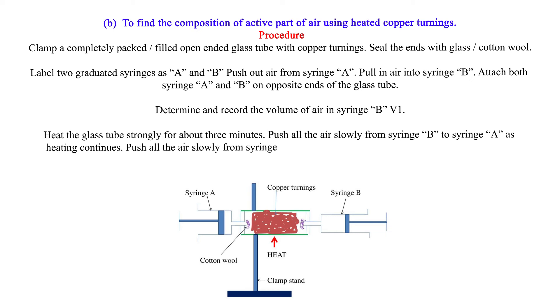Push all the air slowly from syringe A back to syringe B and repeatedly back and forth. After about 10 minutes, determine the new volume of air in syringe B, V2.